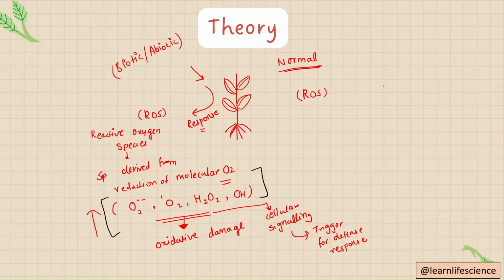For example, superoxide dismutase, in short form it is termed SOD. Superoxide dismutase generally carries out a dismutation reaction.